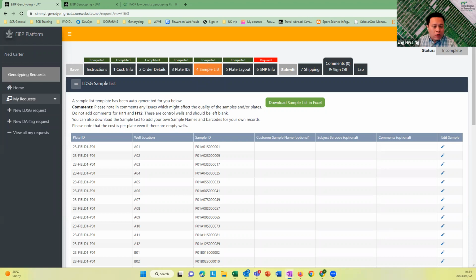But do note that we also have a very large user base that is outside of any breeding database system. If we roll out the system and design it in such a way that we have to link to all the possible features out there, or enable an upload feature, it can potentially cause a lot of issues when the IDs clash.